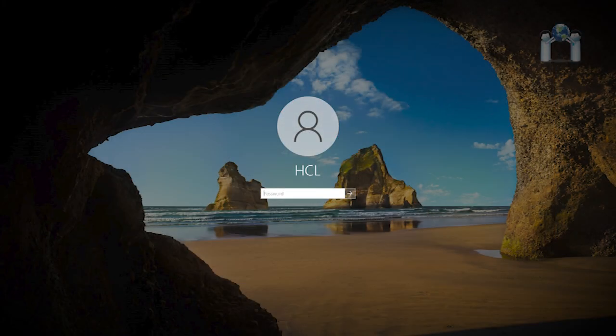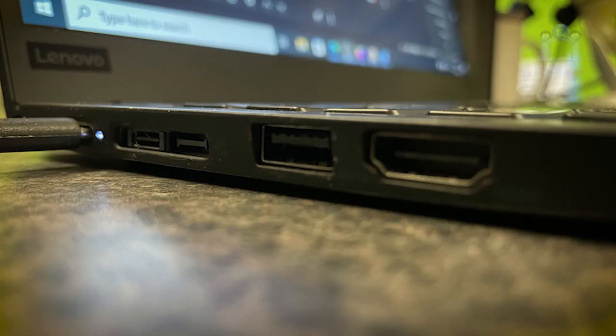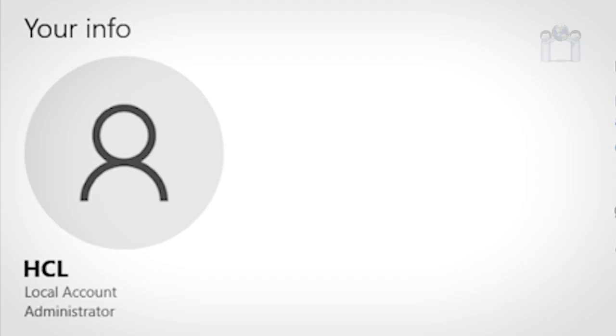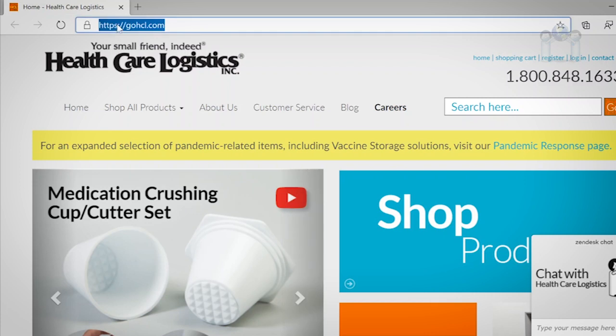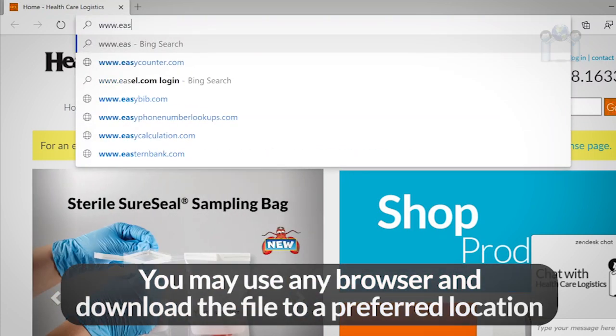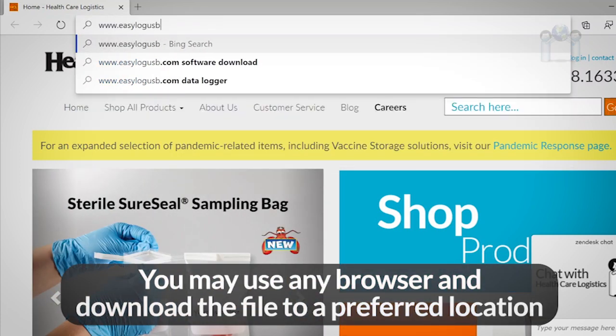To begin, log into a computer that you will use to connect the data logger to. Make sure a USB port is available and that the computer is running Microsoft Windows. Also, make sure you have permissions on the computer to install software. Open a web browser, we are using Microsoft Edge, and go to easylogusb.com.